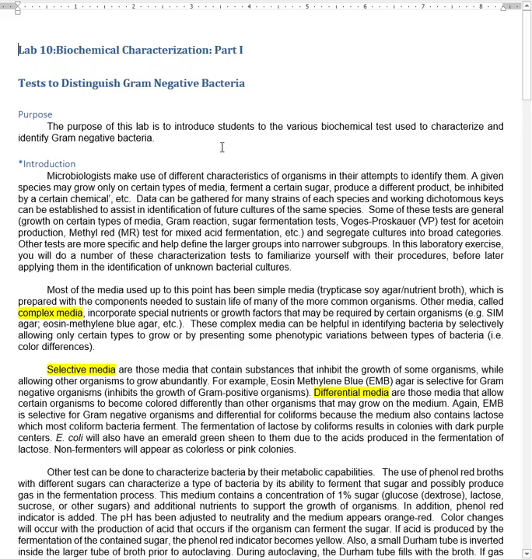Now, we've got several that we're going to be talking about in here. I'm not going to go over what's up here in this introduction because I'd rather go into it when I actually talk about it. But basically, we take these guys and we run them through these tests. And these tests will give us results which will either tell us exactly which bacteria we have, or they'll tell us what is the next test to do in order to continue to narrow down.